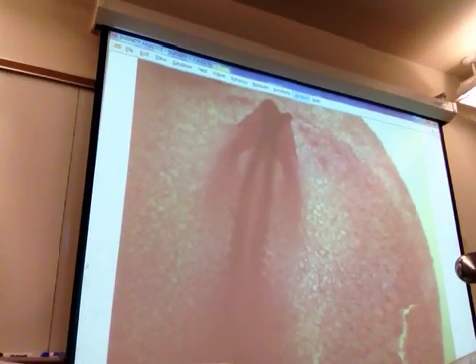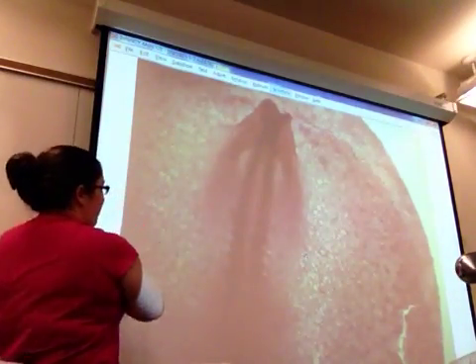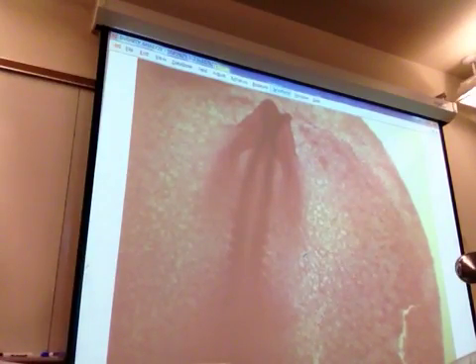So it's stained darkly. Where is the amnion in this? Is it deep to this, or is it above this, or what? If this is the animal. Yeah, so the amnion is going to be like out here. Okay? What's back here? Yolk sac. Yeah. This is a chicken, so there is no placenta.